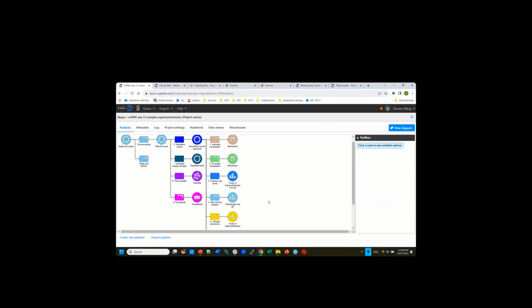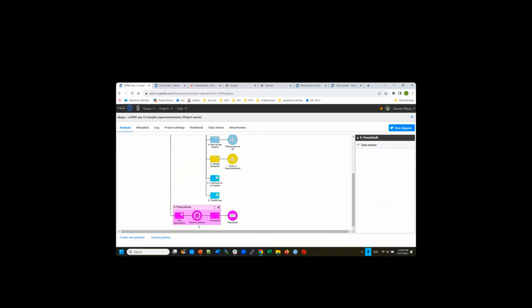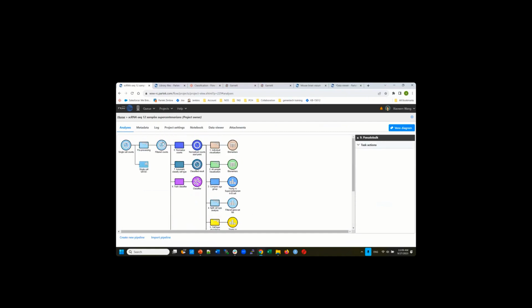So this is what we call pseudobulk analysis. I would recommend you use the raw count instead of normalized count, because if I want to pool cells back to the sample level, I want to add them up. It's almost like I sequenced more on this sample, right? If you use normalized data, it depends on your normalization, and you might want to use different statistics. So this is my recommendation on the raw count.